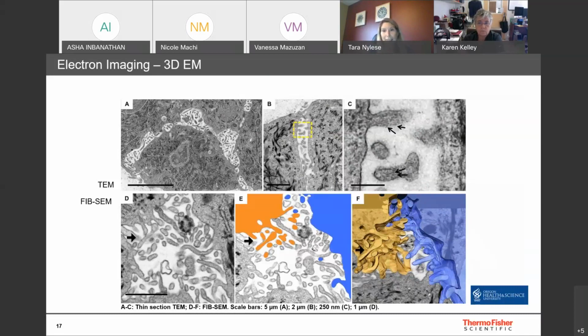So in the TEM, we've got the great luxury of zooming in further so we could see greater detail. And we could even zoom in on one area where these vesicles, so to speak, appear to be budding off of the parent cell. And so again, back to that user interpretation requirement, we might infer that those are budding off and then floating in the space there.